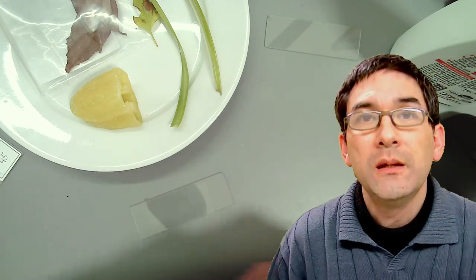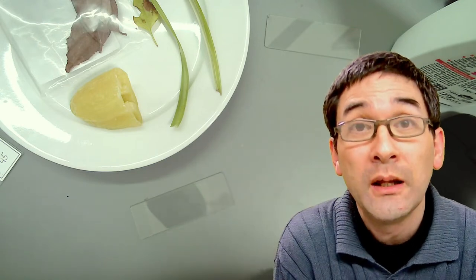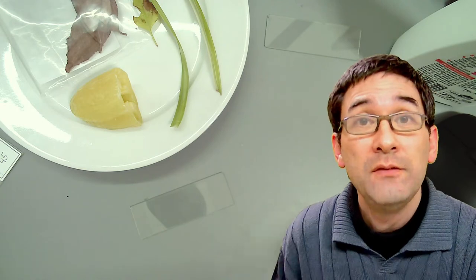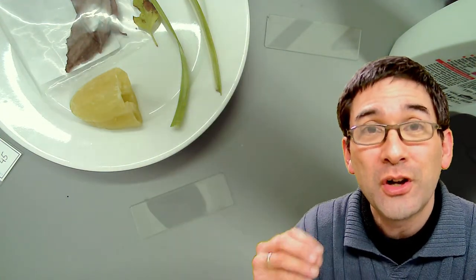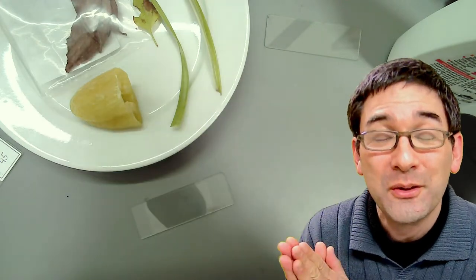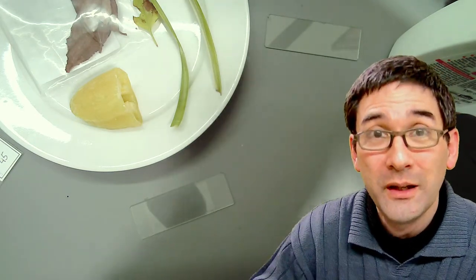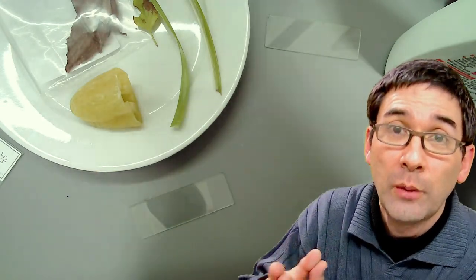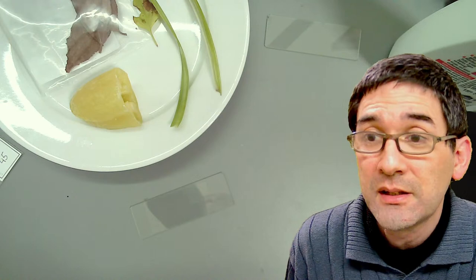Would oil work as a mounting medium? Yes — as a matter of fact, sometimes oil as a mounting medium, specifically kitchen or vegetable oil, is preferred, especially if the specimen is hydrophobic. For example, bird feathers — if you put them into water, it won't work well because bird feathers are oily and greasy. But if you use oil as a mounting medium for bird feathers, they actually look much nicer — they don't stick together and you see it better. So oil as a mounting medium? Yes, and sometimes it's the best one to use.